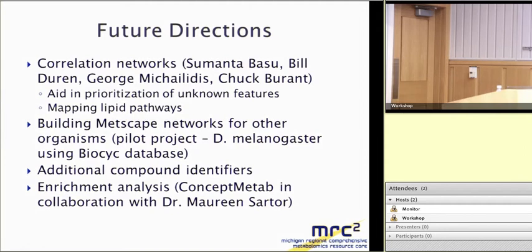But somebody has developed, I saw a publication from somebody in Japan who is not associated with KEGG, I think this person developed his own plugin for Cytoscape that actually lays out KEGG pathways in this nicer view. And so the beauty of working with Cytoscape is that there is a very large community of developers who are developing these various plugins. So it may be possible to actually use their tool to lay out MetScape networks. We looked at that at one point, and I think it can be done. Okay. So right now the best out there is probably the omics viewer. It's the nicest tool right there.